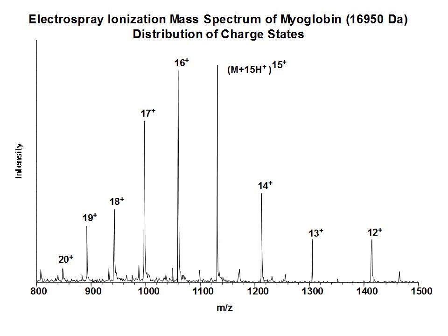On the other hand, there's a big advantage to it too. You have now, instead of 1, 10 measures of the molecular mass of myoglobin. So with a simple algorithm you can now calculate an average molecular mass and a standard deviation. And so your mass measurement becomes much more accurate than based on a single peak.